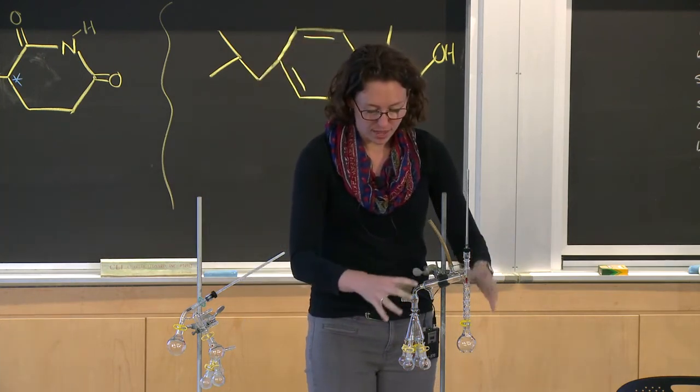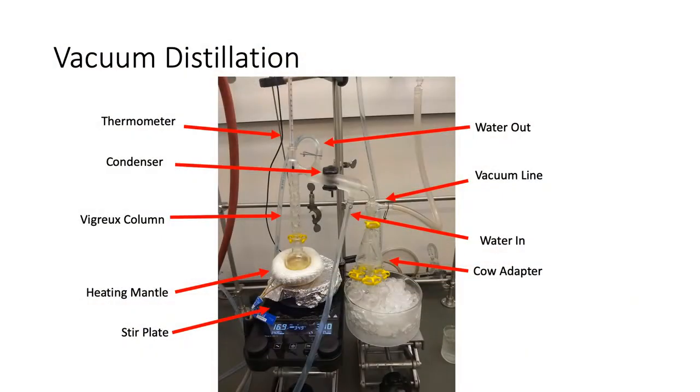So that is the case. And then the last thing that you need to know is the ice bath. So once you have heated up your mixture, you've recondensed your vapor, and you're collecting hopefully another liquid over here.